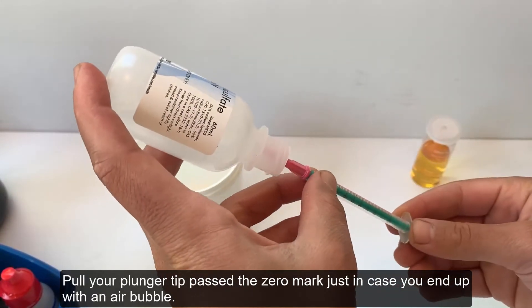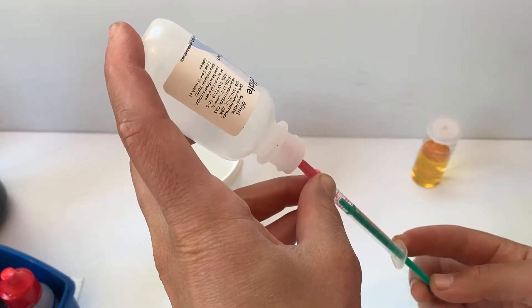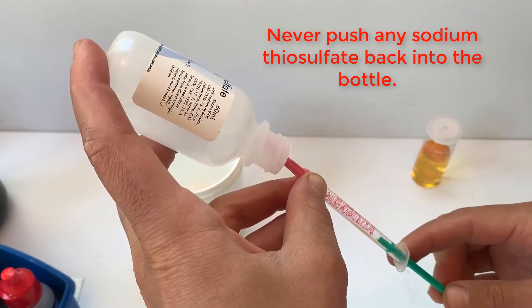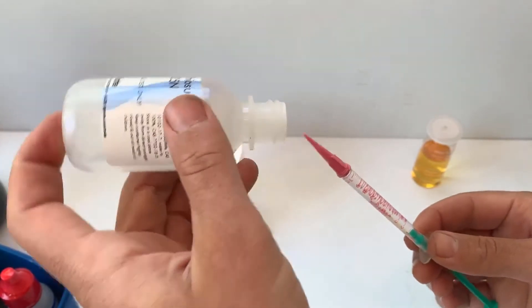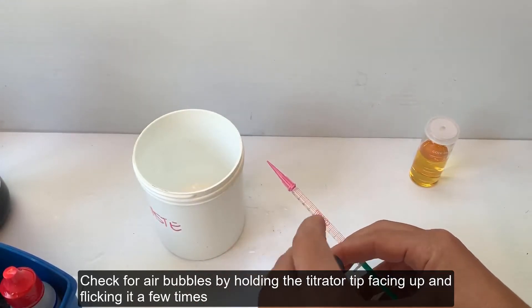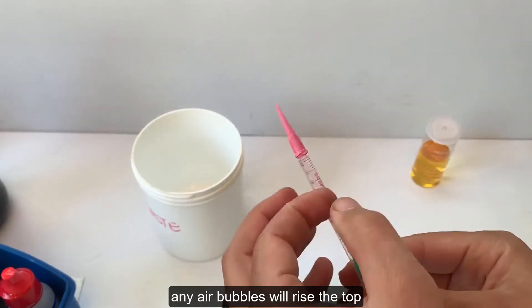Pull your plunger back past the zero mark just in case you end up with an air bubble. Never push any sodium thiosulfate back into the bottle. Check for air bubbles by holding the titrator tip facing up and flicking it a few times — any air bubbles will rise to the top.